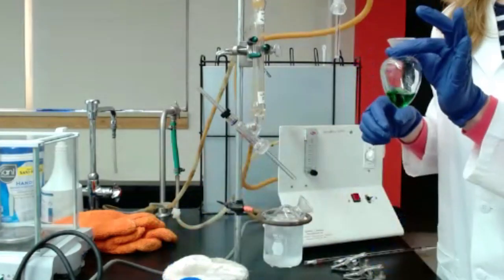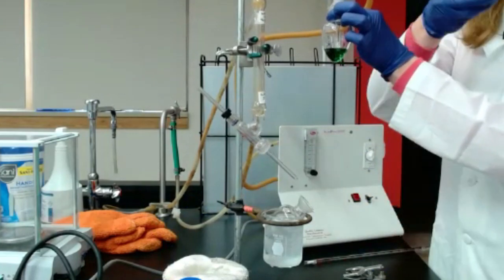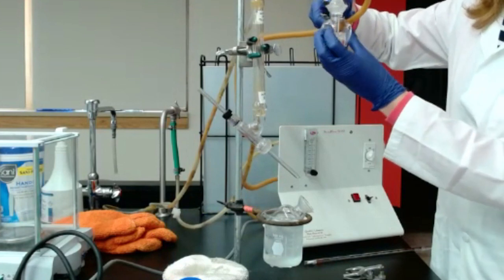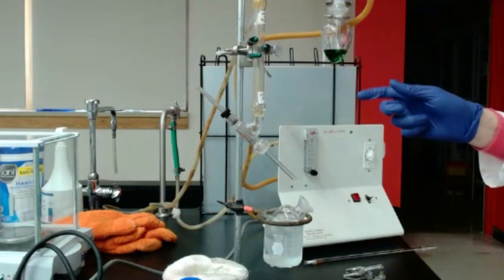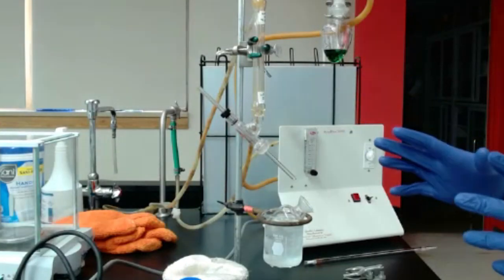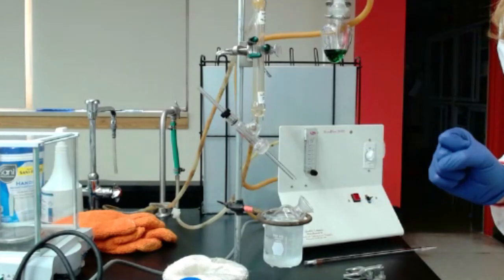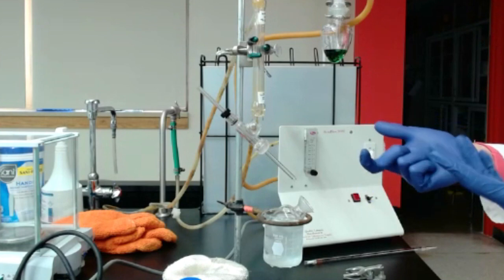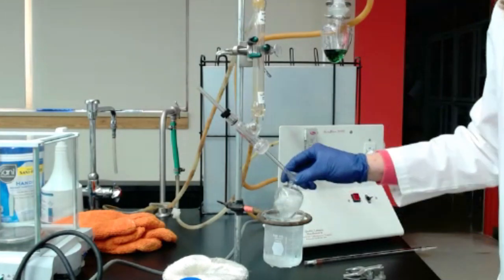And that's the cylinder I'm going to attach here. To do so, you will use clamps, and you will make sure you clip here. One thing to note is everything is in glass, and glass can break. So make sure you know where the first aid kit is, and you know what to do in case you cut yourself, or in case of glass that broke.